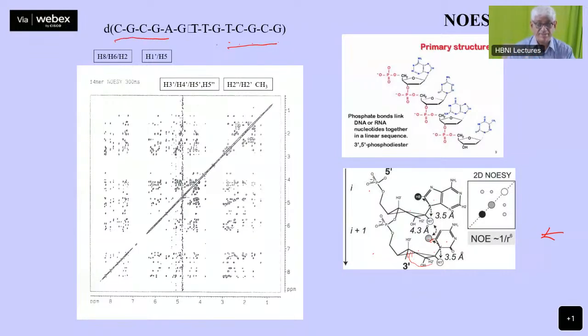These central 4 units, GT, TG, do not form base pairs. Therefore they form a loop. They loop out of the duplex, and if I write the sequence in this manner again, either it can form a duplex or it can form a hairpin.